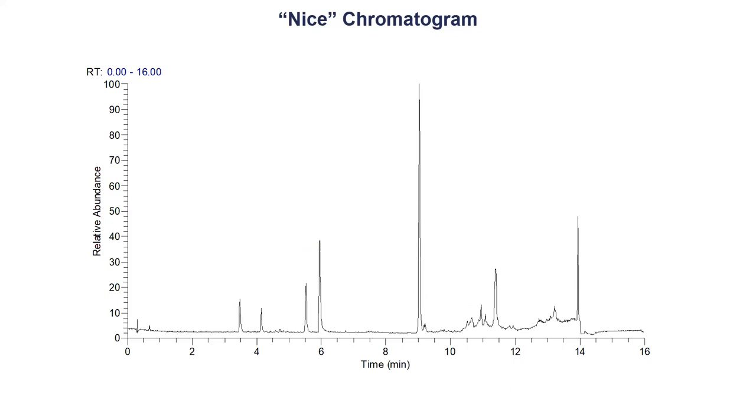Of course, the basic idea, if we use this, for example, as a standard, and we have maybe 5 compounds, and we want to separate all reference compounds that we have, and then we see 5 peaks here, so we are good. And then of course we have a washing step, where everything else is coming out of the system. But this is basically the idea that we want to have: to separate all ions, or as many ions as possible, and then get a nice chromatogram out of it.